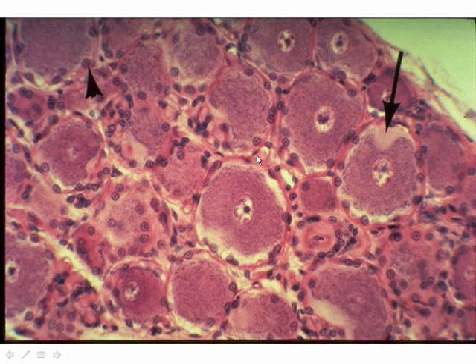Now notice the amount of connective tissue that exists, indicated by the red staining outside of the cell. And there are also nuclei which actually almost indent upon the neuron cell bodies. These are called satellite cells, and they very carefully wrap around every single neuron cell body in the peripheral nervous system.